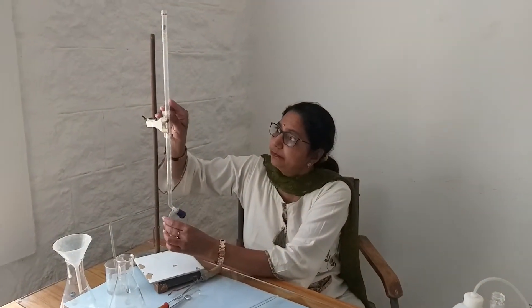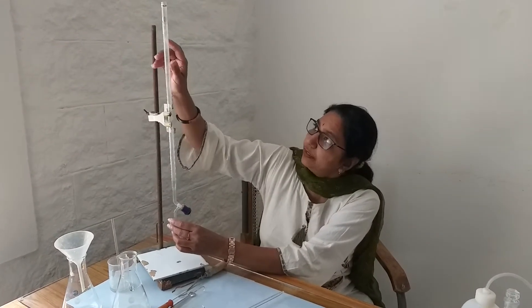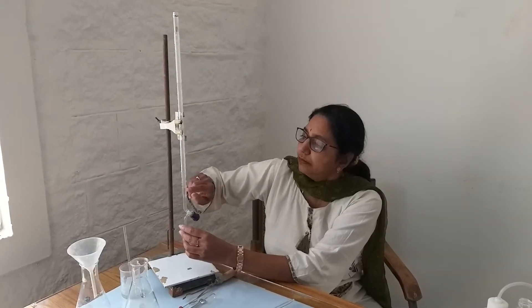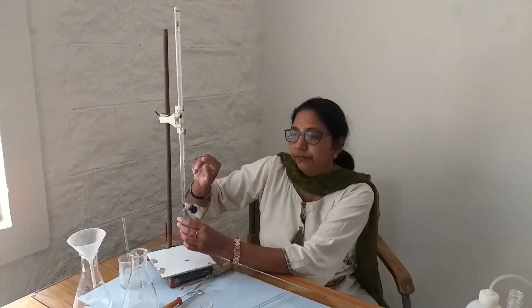The buret is a long slender graduated cylinder. When we fill the solution, it should reach up to the zero mark at the top. The below mark is 25 ml. There are burets with a capacity of 50 ml or 10 ml. Depending upon the use, we go for different capacities of burets and pipettes.